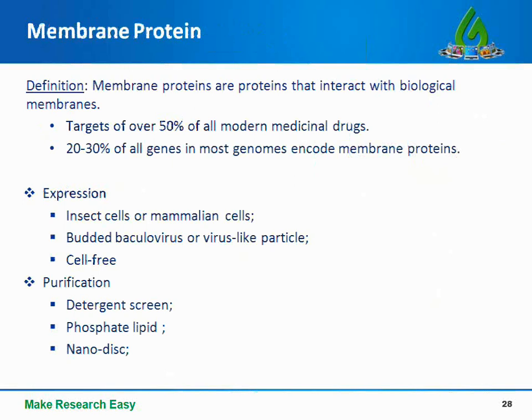Membrane proteins, by definition, are proteins that interact with biological membranes, which are targets of over 50% of all modern medicine drugs. In most genomes, 20 to 30% of all genes encode membrane proteins, so there is probably a good chance for you to encounter a membrane protein expression project.